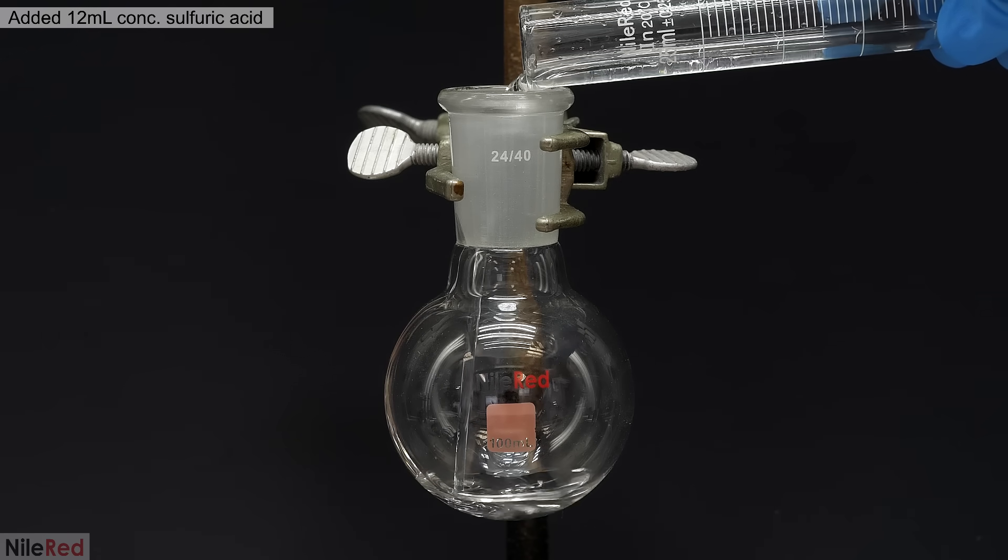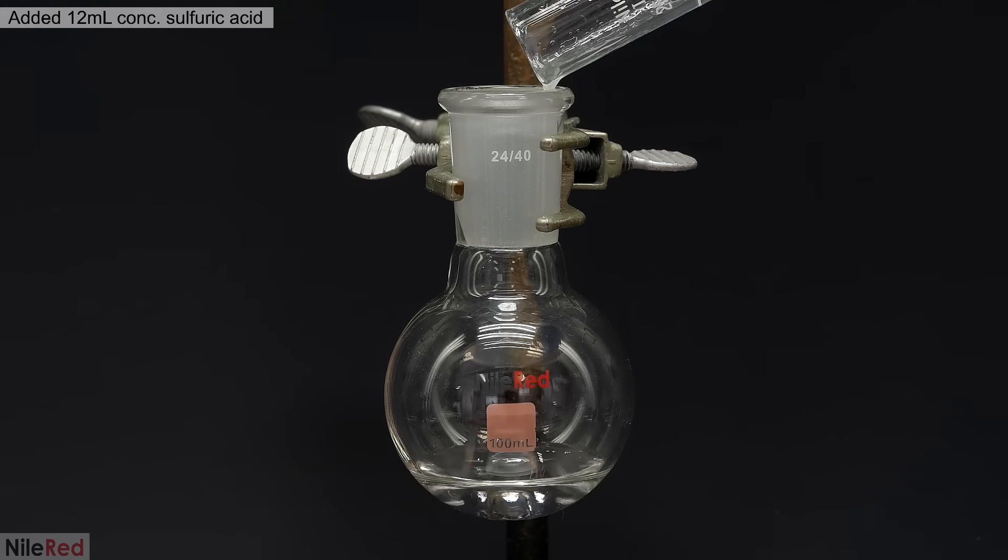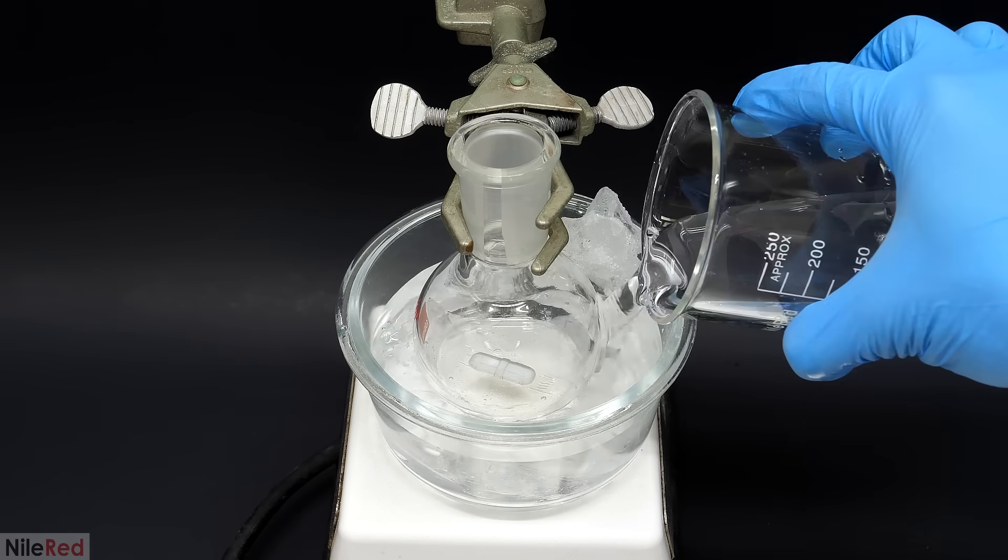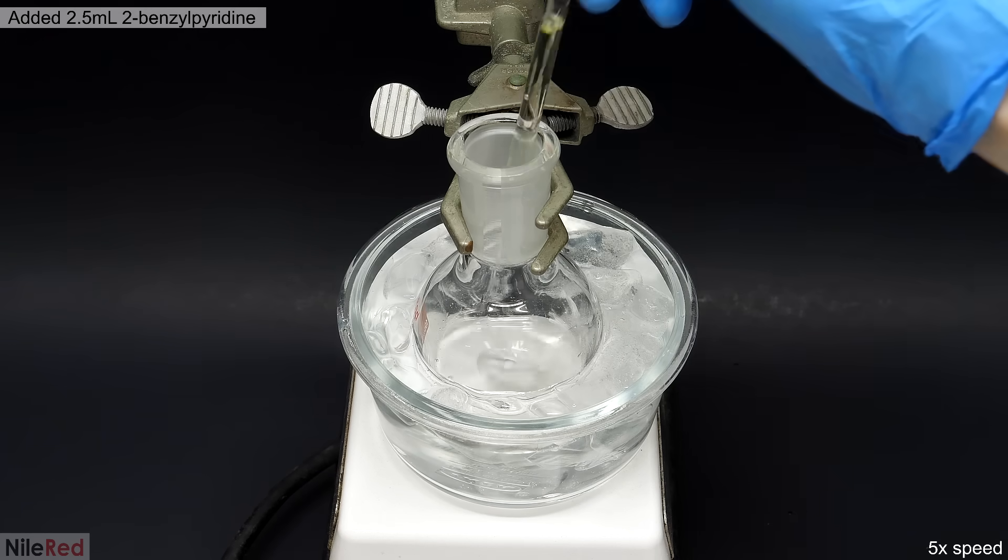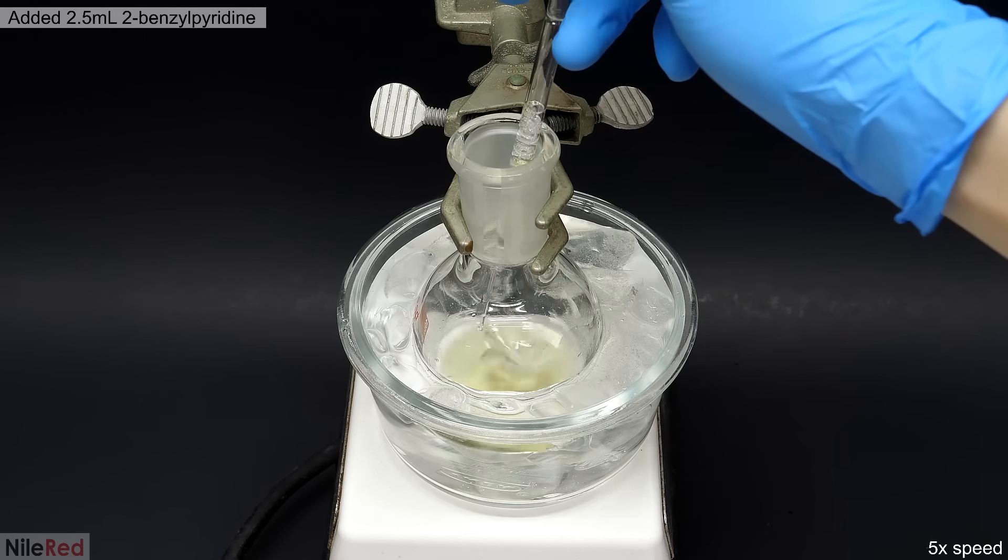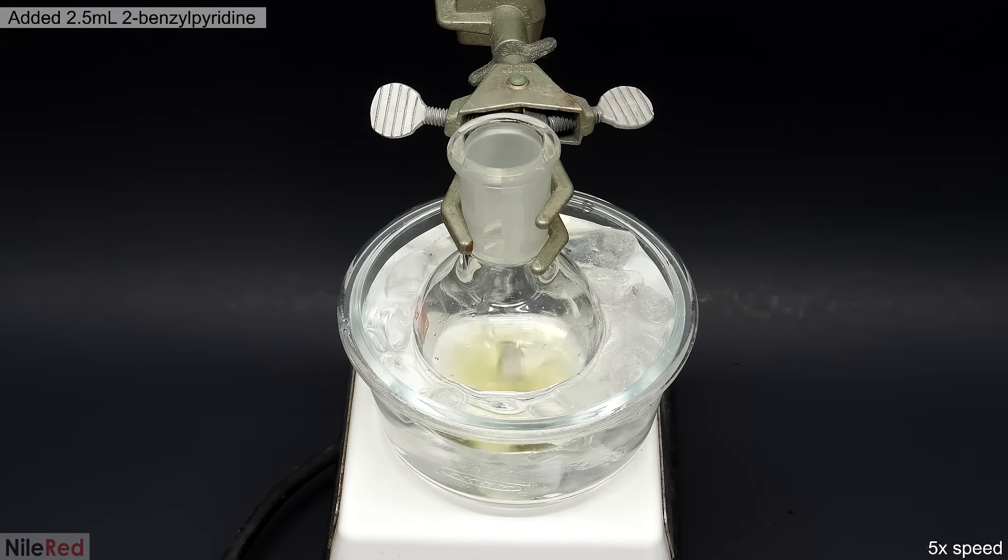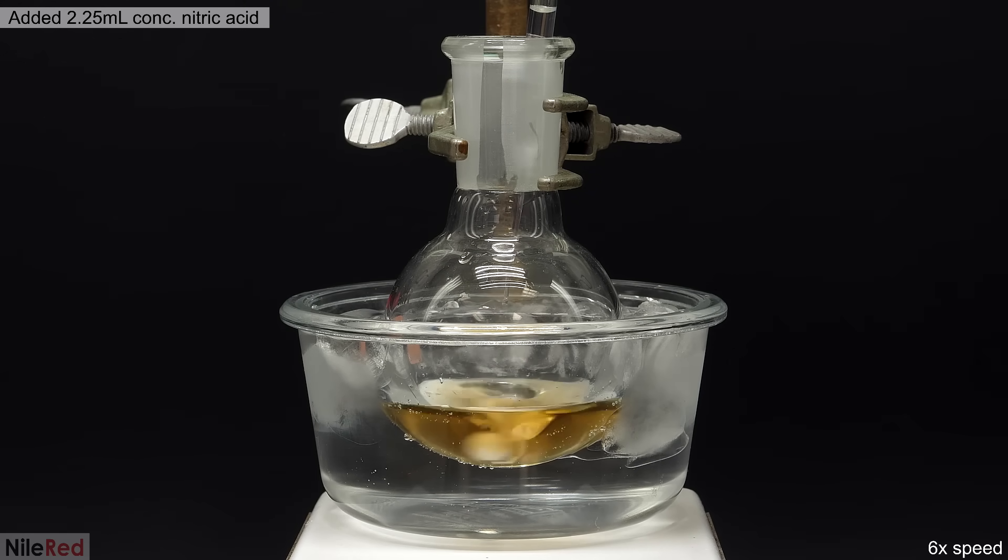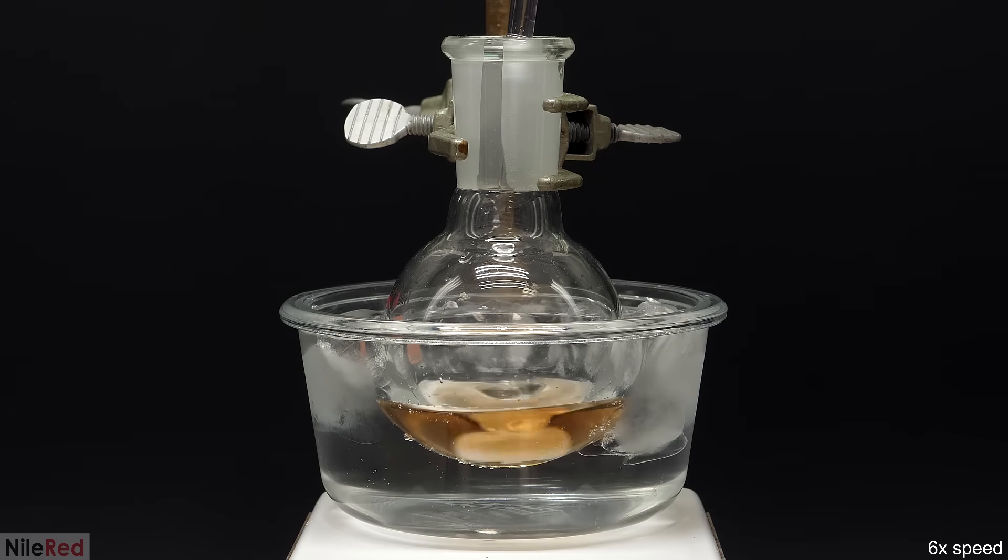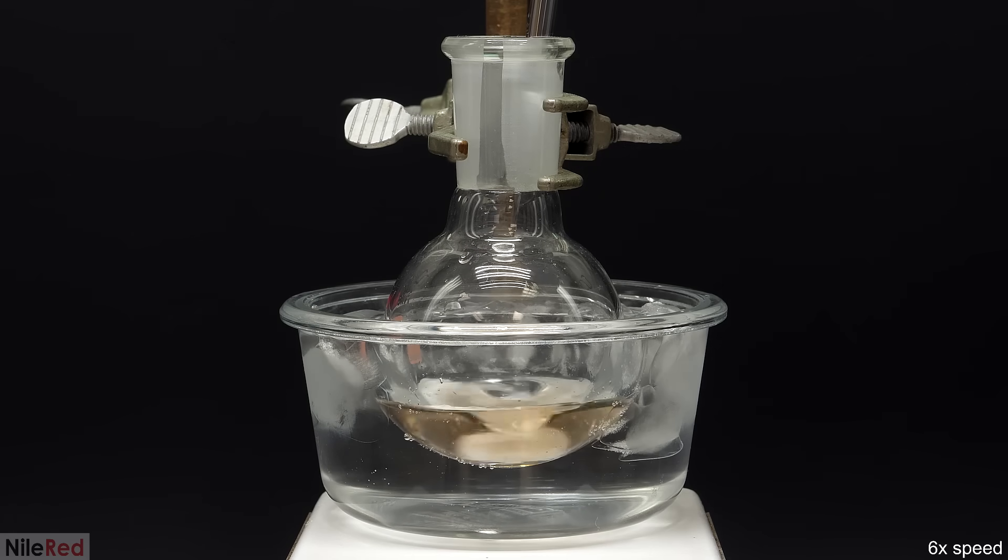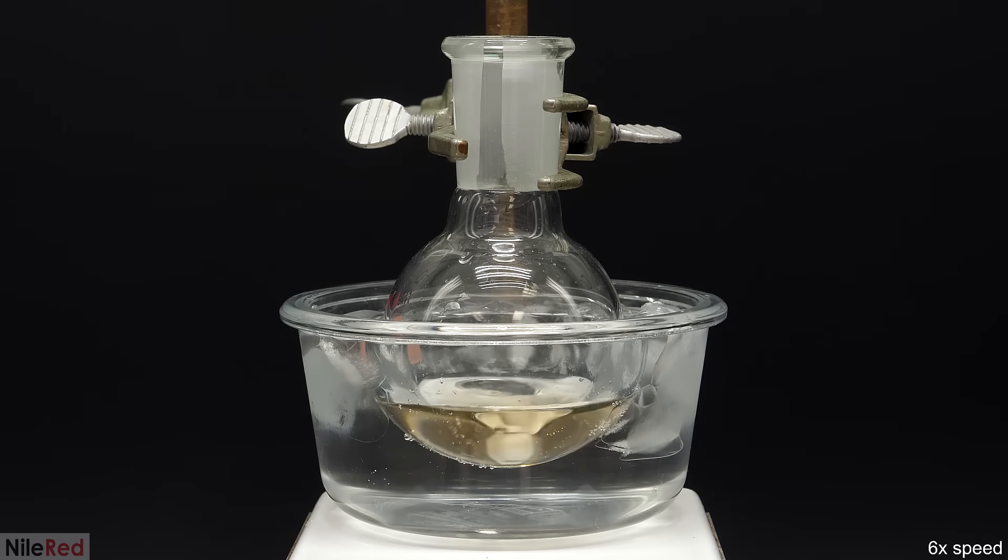To start things off, I added 12 mils of concentrated sulfuric acid and a stir bar to a small flask. Then I set up an ice bath, and I let it cool to around 5°C. To the acid, I slowly added 2.5 mils of 2-benzylpyridine, and a faint yellow color appeared. I let this stir for a few minutes, and then I added 2.25 mils of concentrated nitric acid. This entire addition was done carefully and drop-wise over the course of about 4 minutes. During this time, it went through a range of colors, but by the end, it was pretty much colorless.